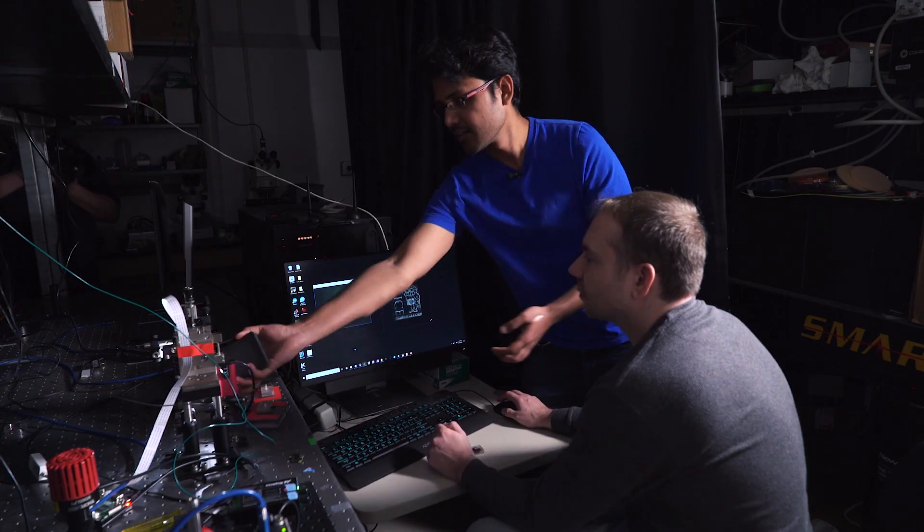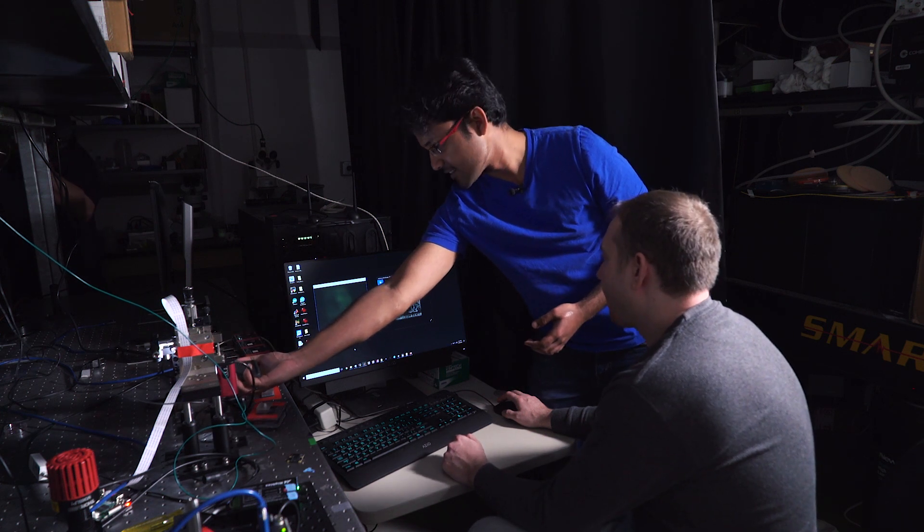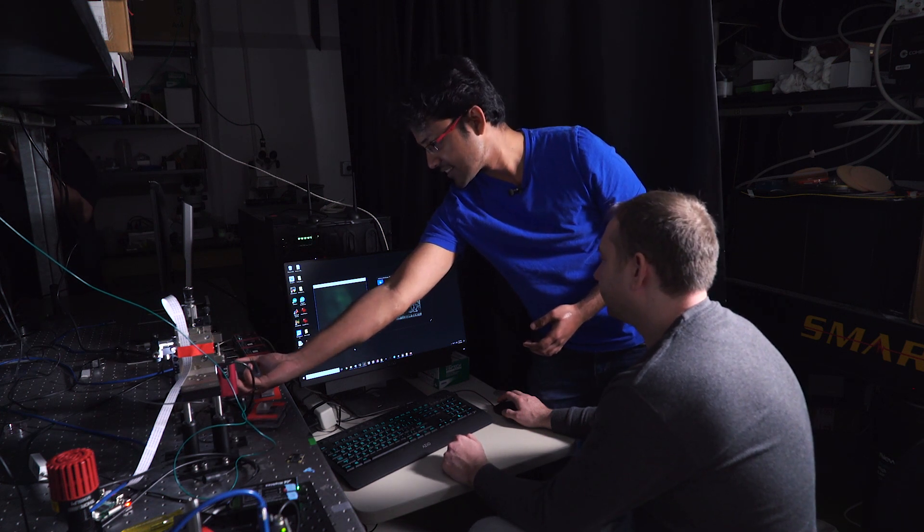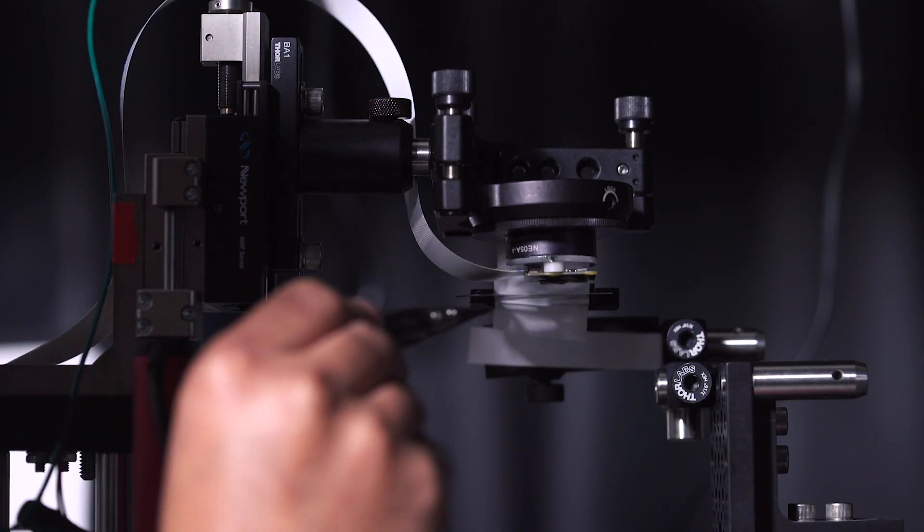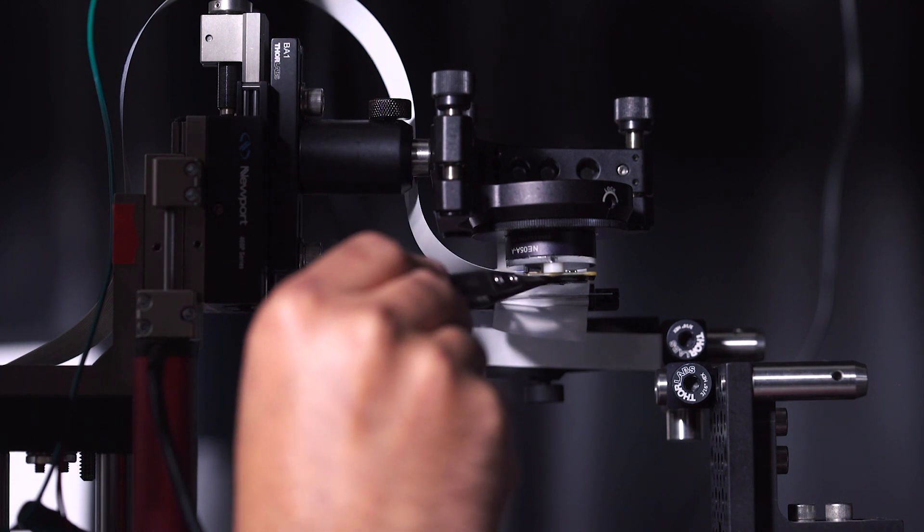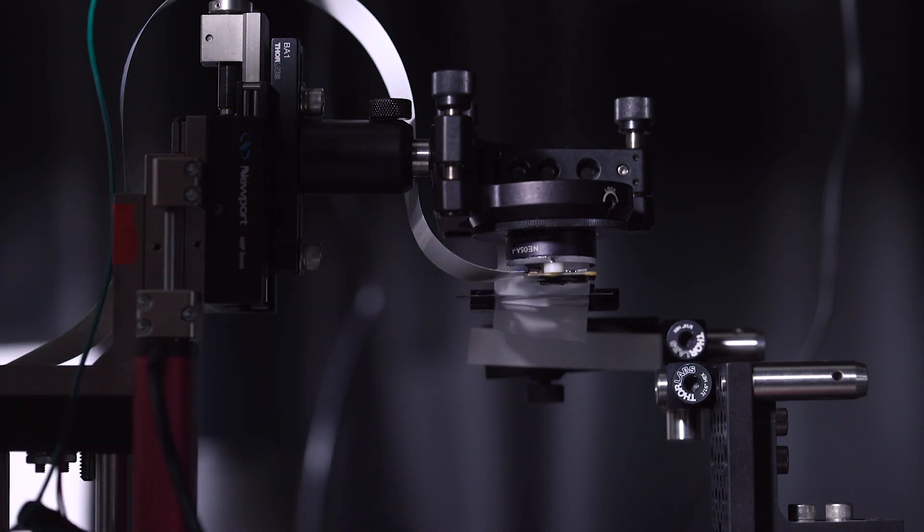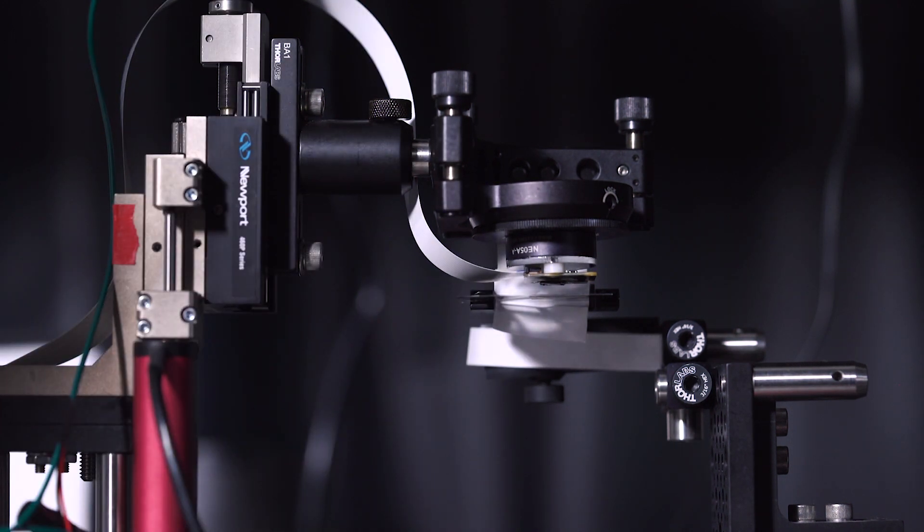There's a couple of reasons why we're interested in this. One is that there's this trade-off when you have a lensed microscope between magnification and your field of view. Basically, if you want to zoom in on a very small object, you need large magnification, but when you do that, you don't get to see very much of your sample.